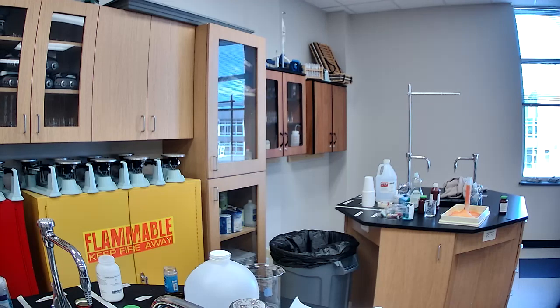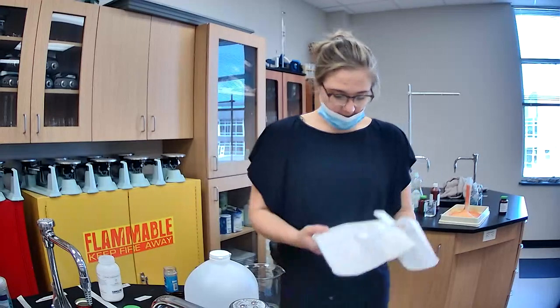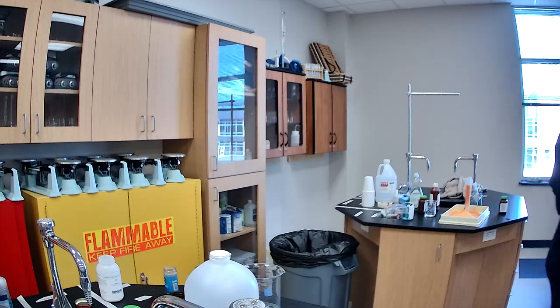Okay. So, that's our last experiment there. But I am going to let you touch the gooey. Oh, it's like a marshmallow that's not perfect. No, it's not warm, but you can tell it's certainly harder than it was before. That feels so weird.